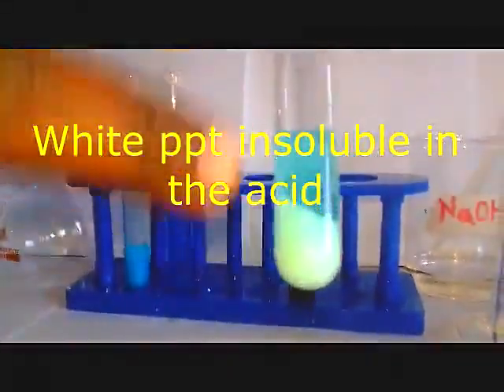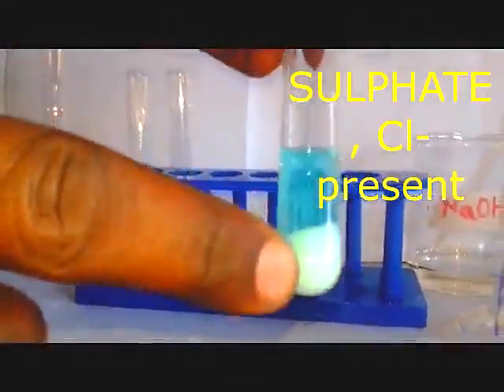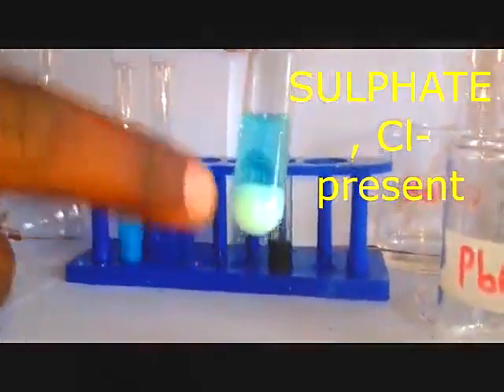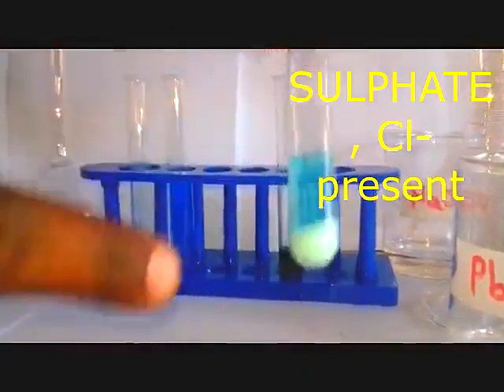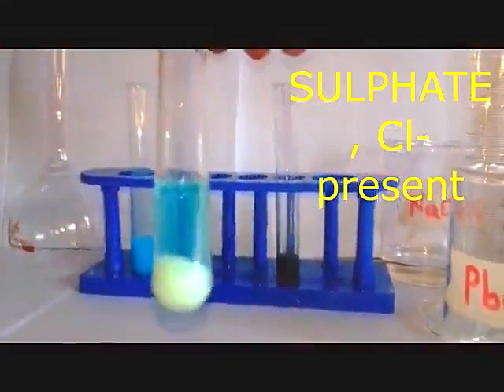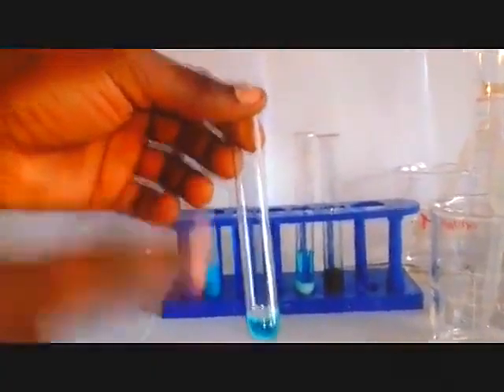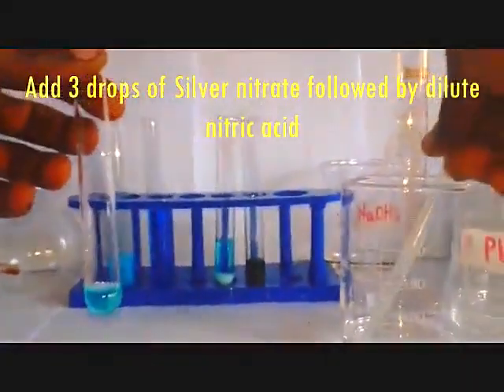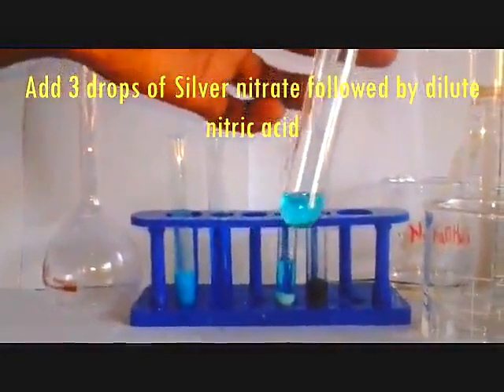So it's only 2 anions which can give this, suspecting it to be either chloride ions or sulfate ions. So your deduction or conclusion, you are going to say chloride, sulfate, suspected present, or you can just say present. So since we are having 2 anions, that is chloride or sulfate, we need to confirm 1. So we are going to add silver nitrate, followed by nitric acid, which is dilute.